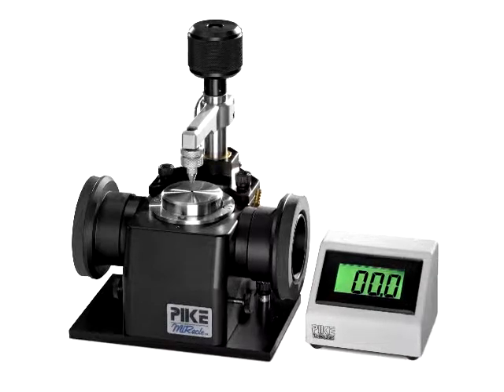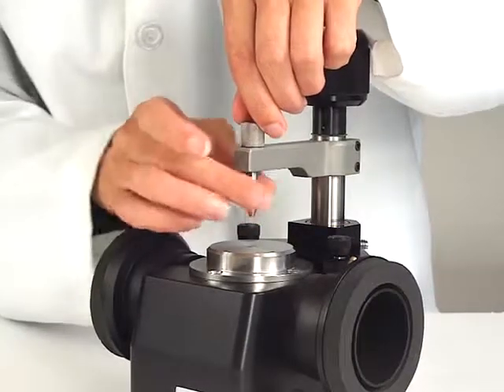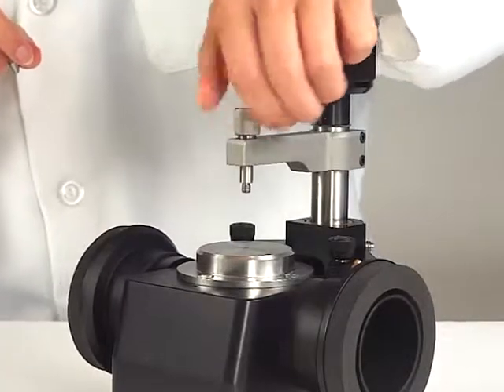Installing the digital force adapter on the Pike Miracle ATR. Remove the press tip rod from the Miracle high pressure clamp by unscrewing the rod from the top of the horizontal clamp arm.